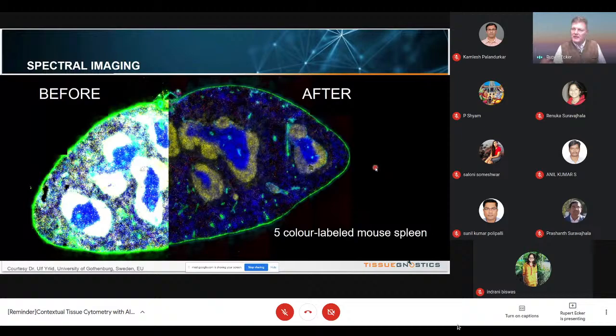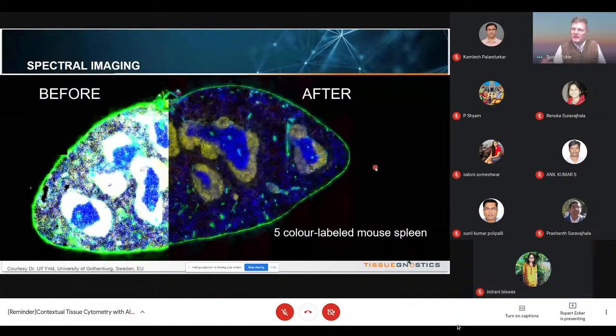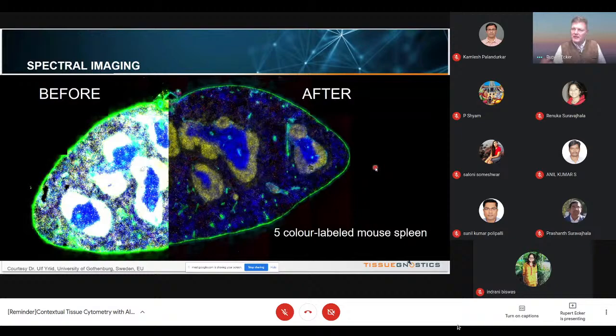When we talked at the beginning of this presentation about a confocal microscope, we talked about the Z stack, where in a Z stack you look at a given sample, a given region, in different focus positions. In a lambda stack, you look at the given sample in the same focus position, but in different spectral intervals. And by using a mathematical procedure referred to as spectral unmixing, the computer can calculate how much of the total spectral emission comes from fluorochrome 1, 2, 3, 4, 5, 6, 7, up to 10. And then we get a very nice, clear and brilliant picture.